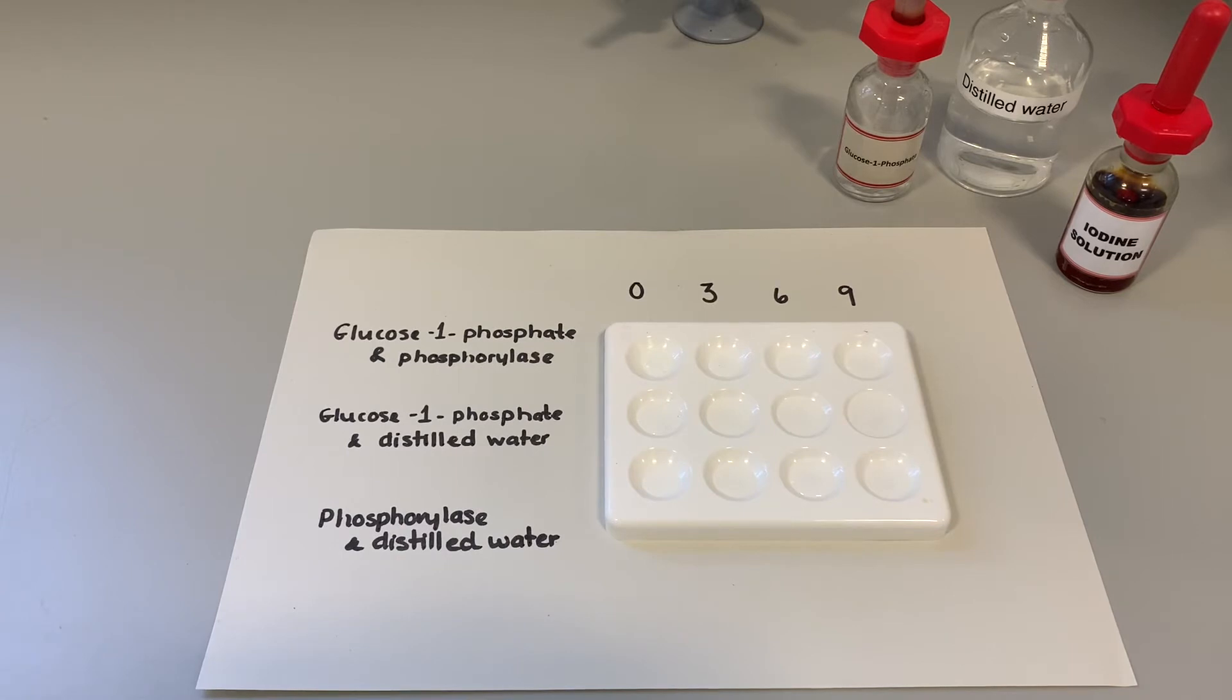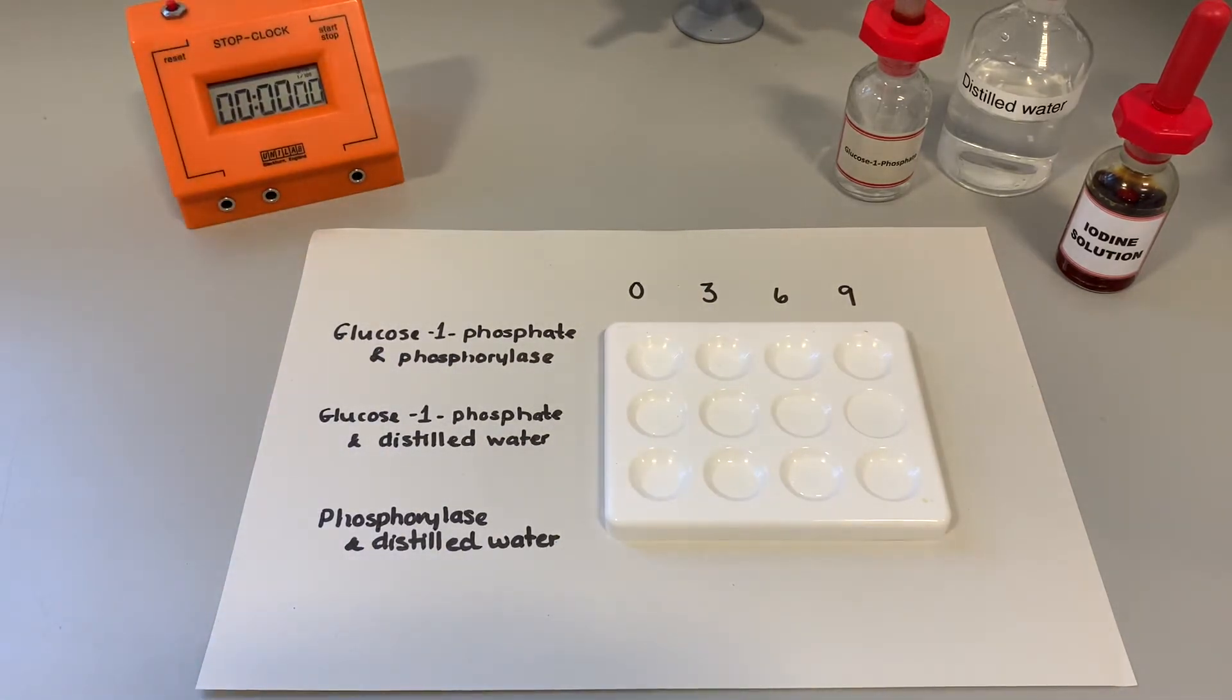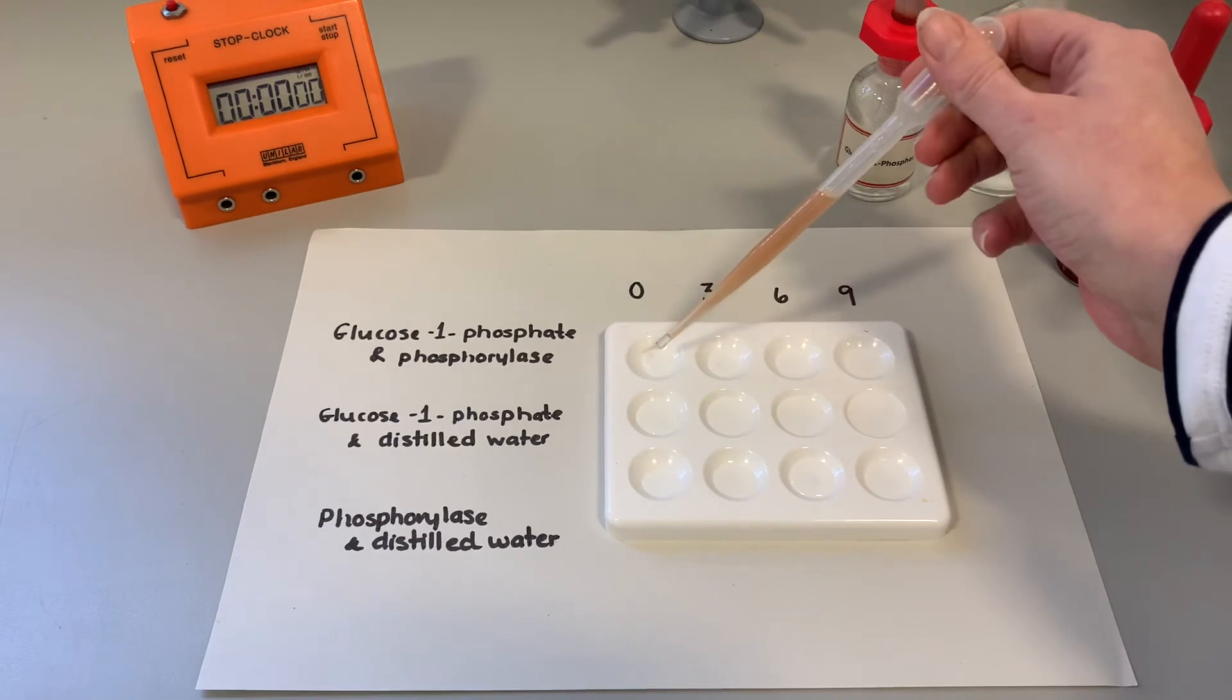So I'm going to add phosphorylase to the first row and the last row. And then we're going to start the timer. We're going to add a few drops of phosphorylase to this row here.